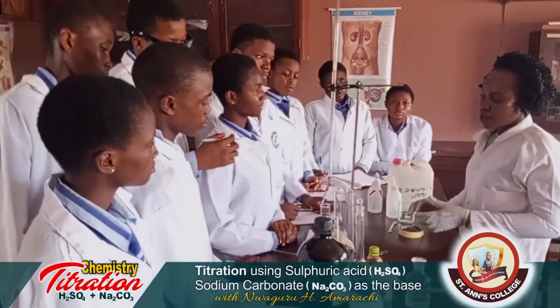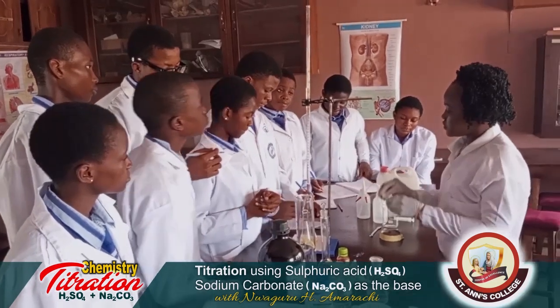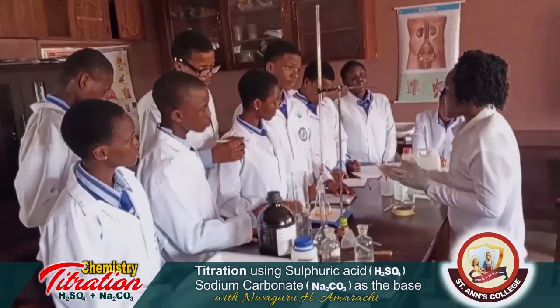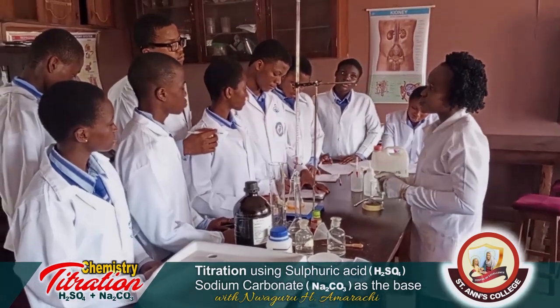So, as you can see, we have gotten our endpoints of rough, first titre, second titre, third titre. Now, we're going to run an average. We have to calculate the average of this to find the volume of the acid used.